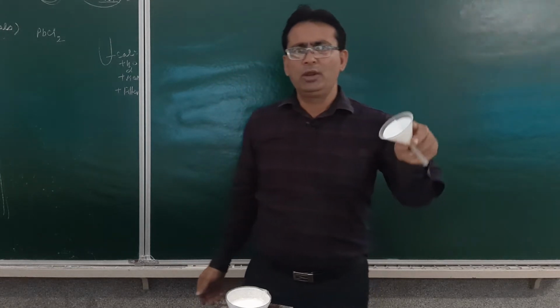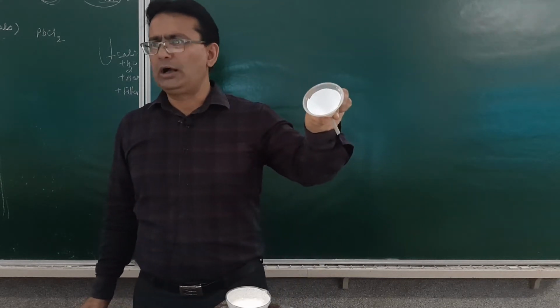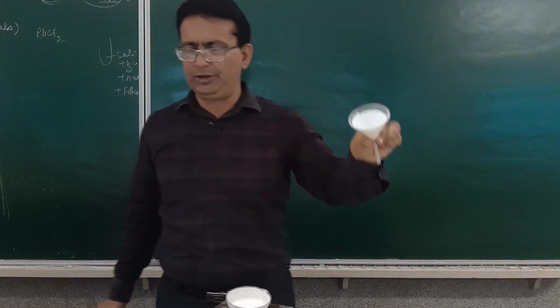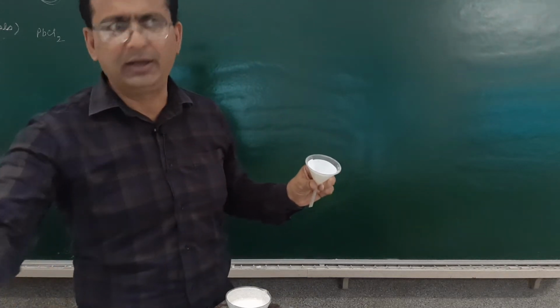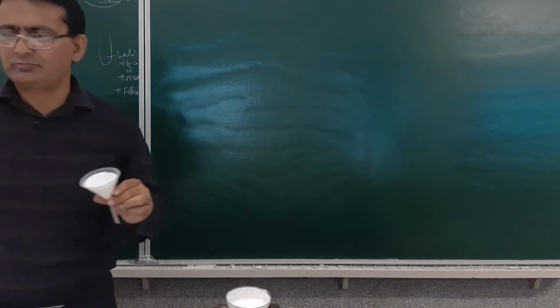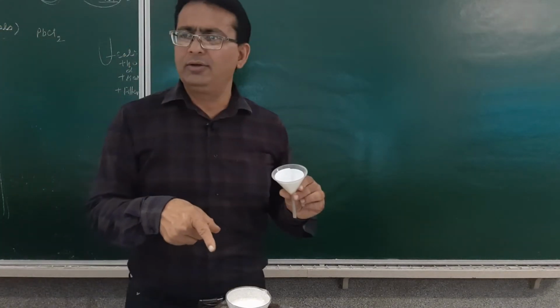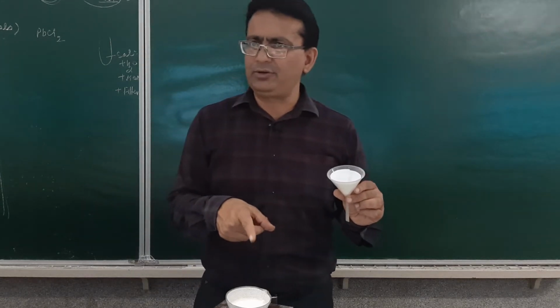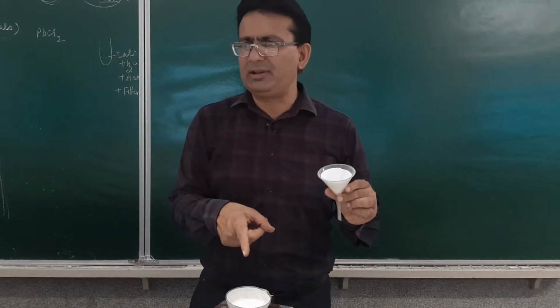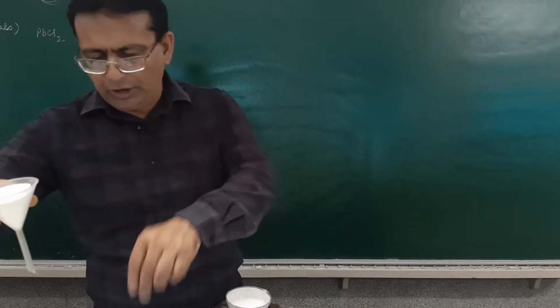Am I clear? Now I will be filtering through this system: a funnel having a filter paper in it. I will take the solution from the sodium carbonate extract, which is being heated up in the china dish, and try to filter it.